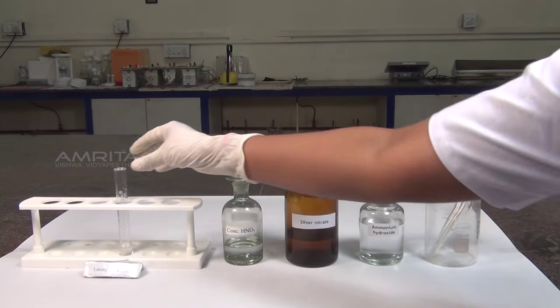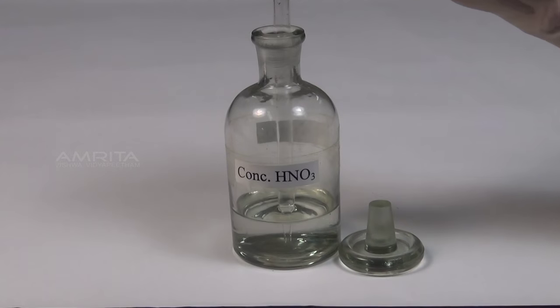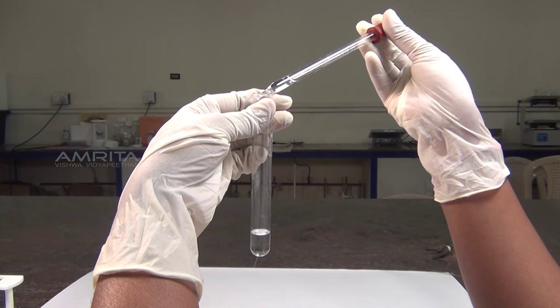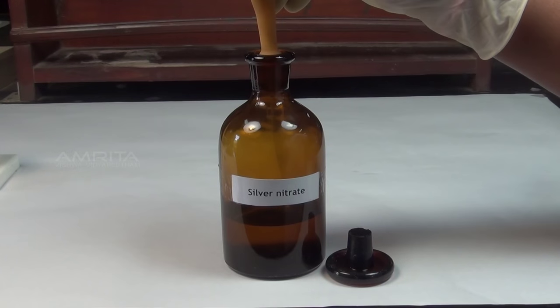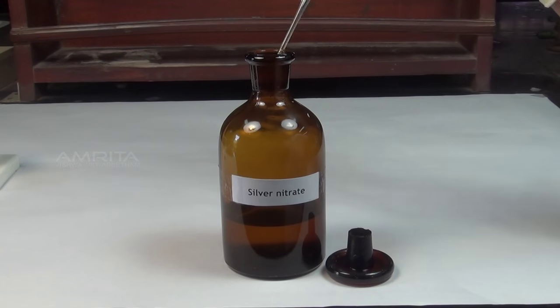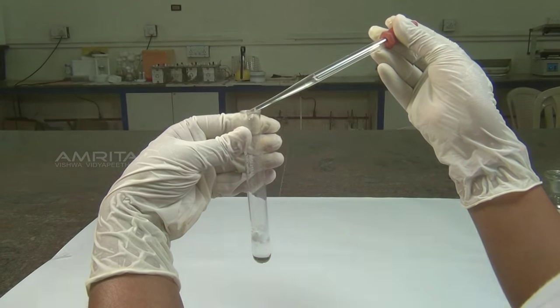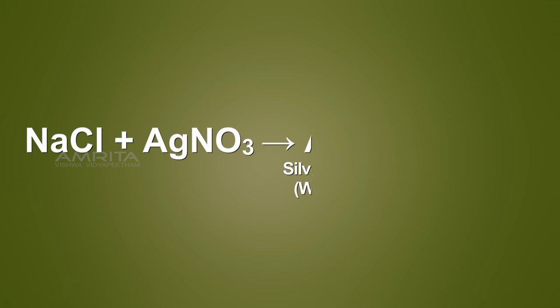Procedure: Take a small portion of Lassaigne's extract in a test tube. To this, add a small amount of concentrated nitric acid using a dropper. Boil the contents of the test tube over a Bunsen burner and cool. Using another dropper, add silver nitrate solution to the test tube.